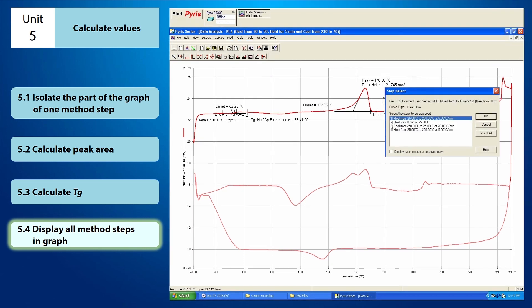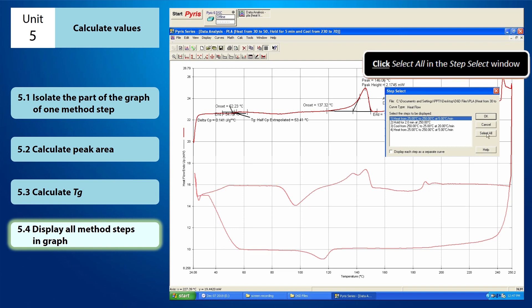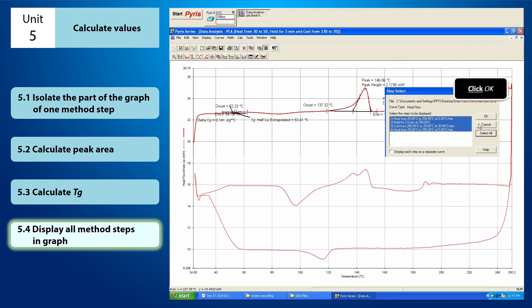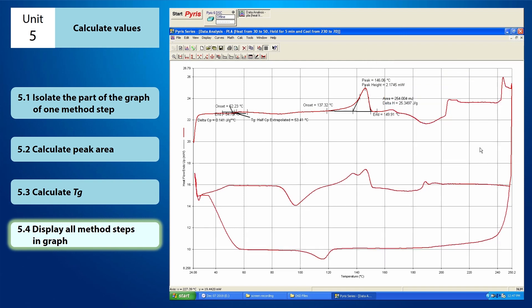From the Step Select window, click Select All and click OK. Now all the method steps of the graph are displayed on the instrument viewer.